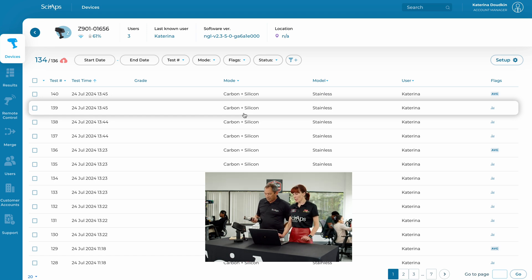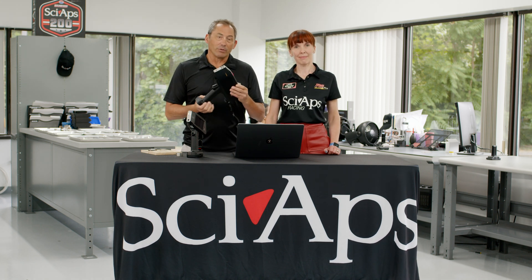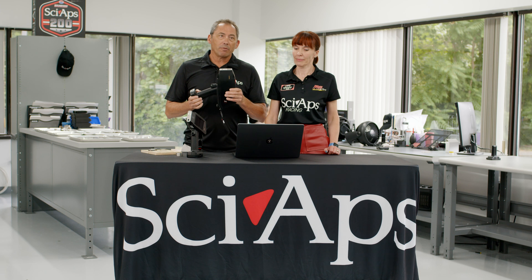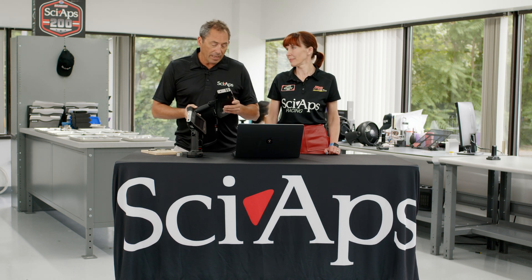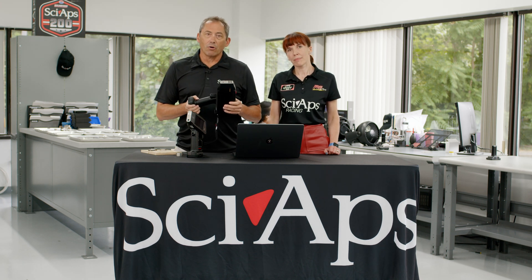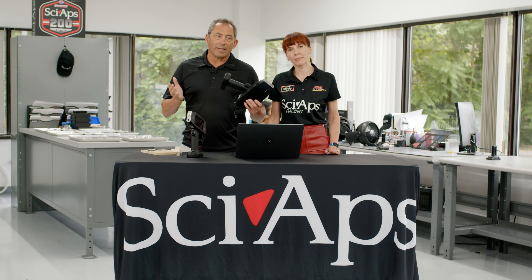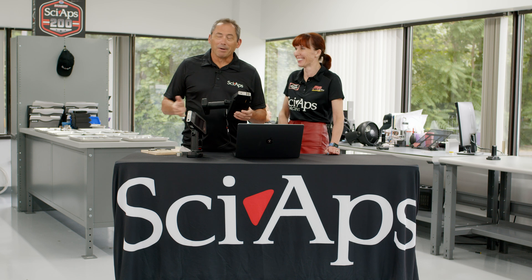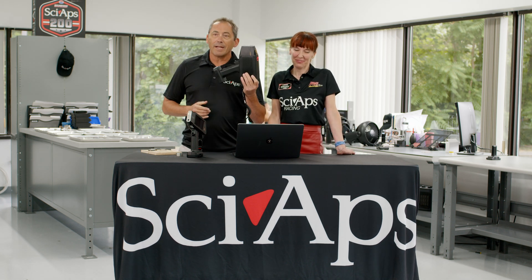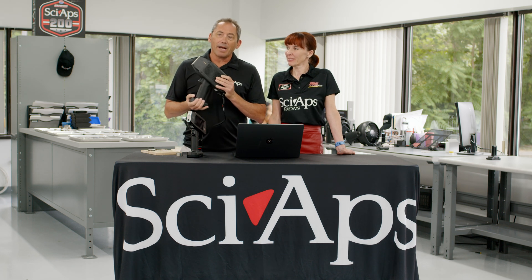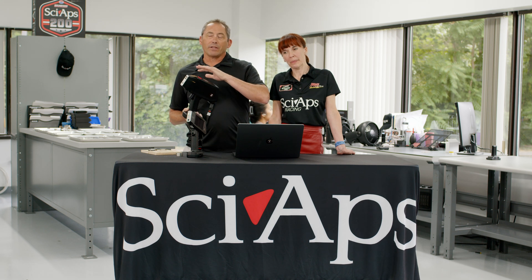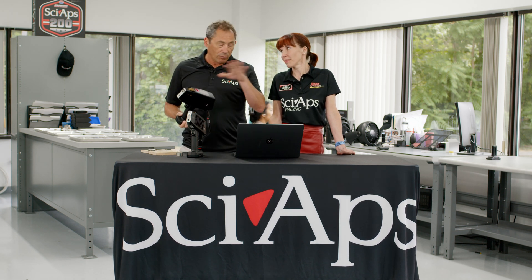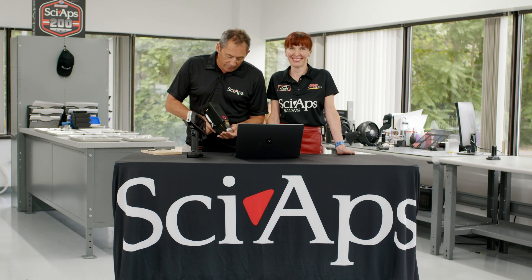So now you can take a test. So this is our what we call our CSI analyzer. It's laser-based, and it only measures carbon and silicon in stainless and steels, I think maybe nickels. And the reason we made this analyzer is because there's a lot of XRF owners out there. And as you all know, X-ray can't measure carbon. Do you know that? X-ray can't measure carbon. So we made an analyzer that was less expensive than a full-blown LIBS that customers could buy if they just wanted to add carbon testing to their capability. So for a lot less money, they could use their existing XRF and their new CSI, and they could do the full range of PMI work. But anyway, enough about that. Just to show you how this thing works.